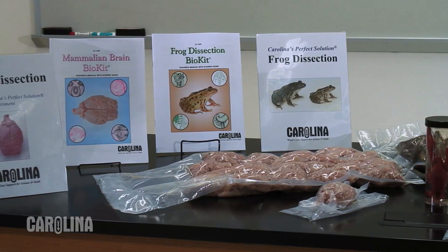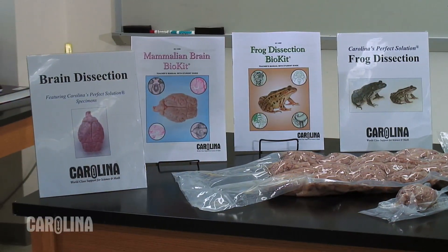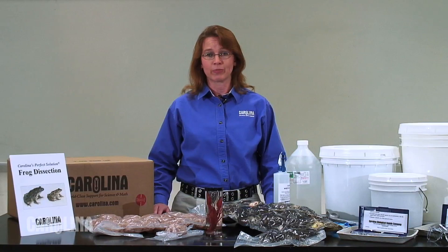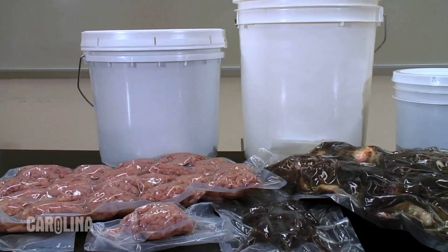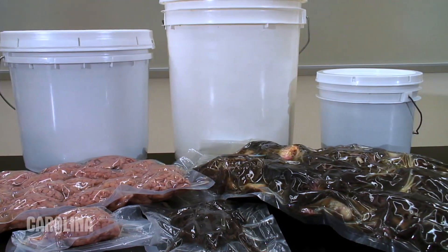If you're teaching a dissection activity over several classroom or lab sessions, it's important to consider specimen storage to keep them as fresh as possible. Carolina provides two types of specimen packaging: vacuum-sealed bags and pail packaging.